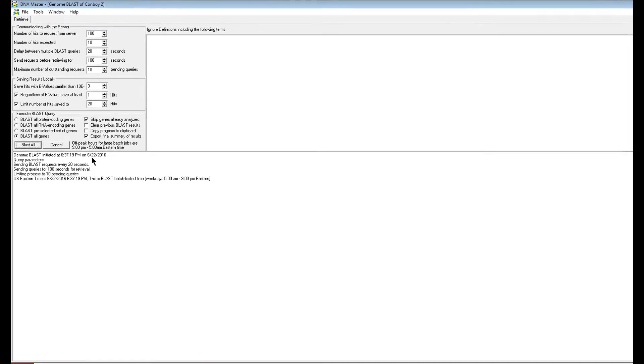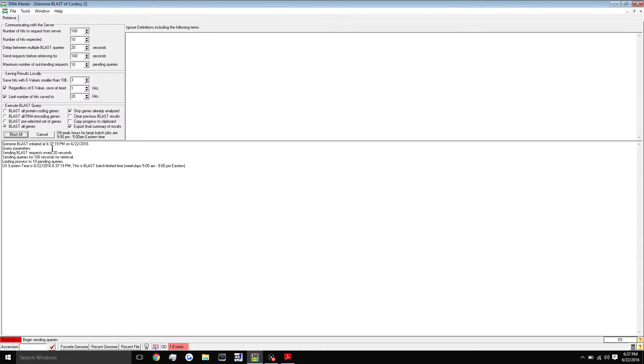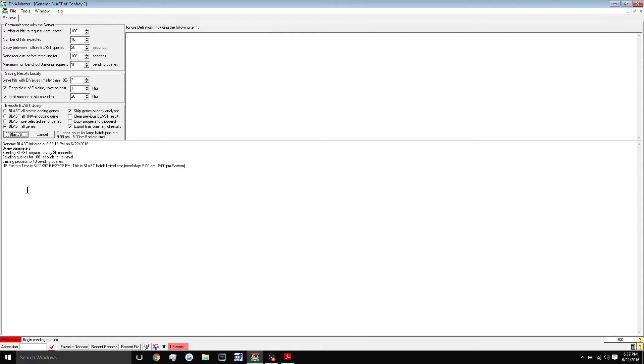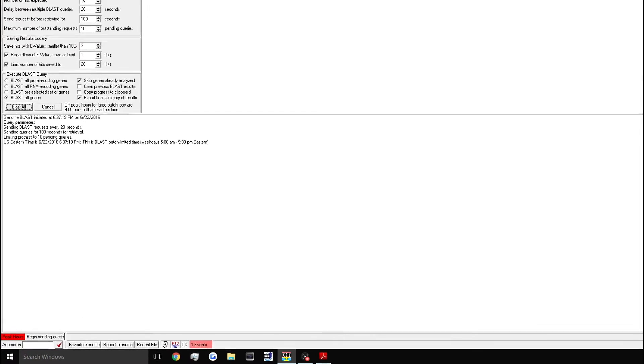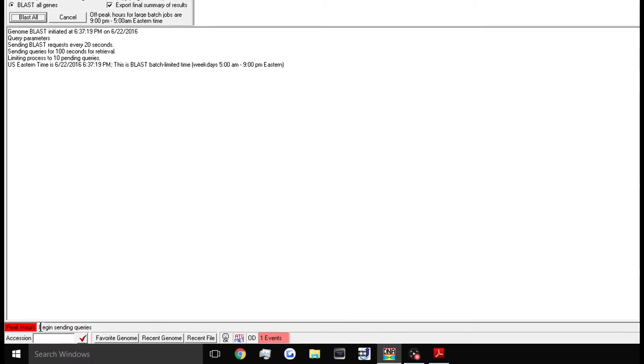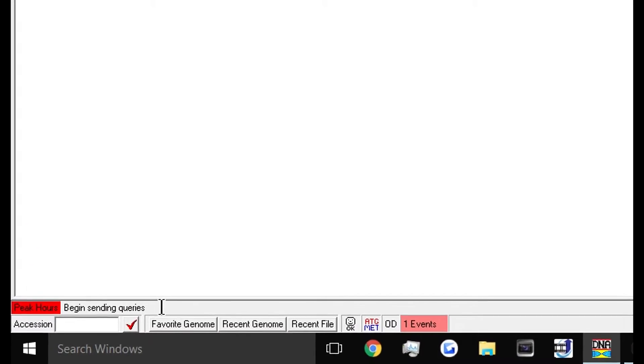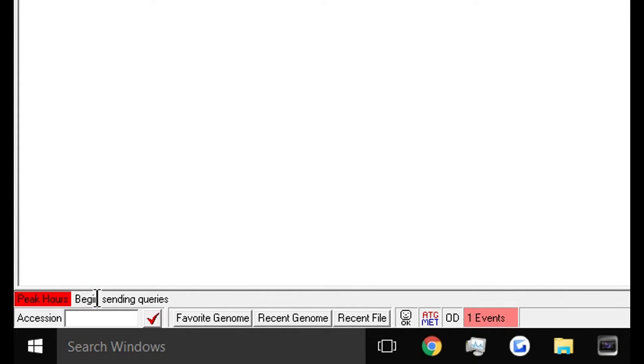You'll see it has a little bit of a log down here. It tells you when the thing was started and every so often it'll paste some more updates into this section where you can view the status of your blast. You can also look in the bottom left hand corner. Right now it's beginning to send all of the requests to the server. If you notice in the bottom right hand corner, this is the total progress in percentage.